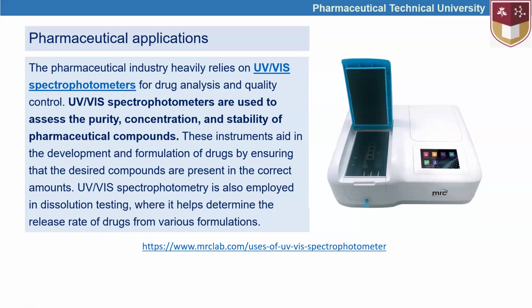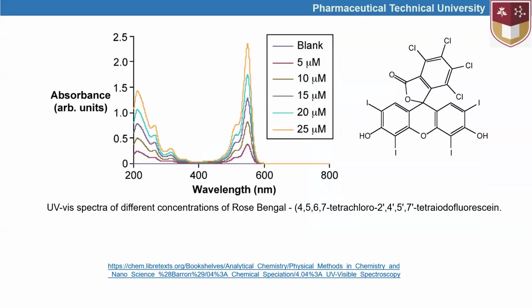We are going to see some exact figures and understand the meaning of this text in the next coming pages. Here we can see the concentration and the changes in the concentration and the intensity of absorption of this given compound.